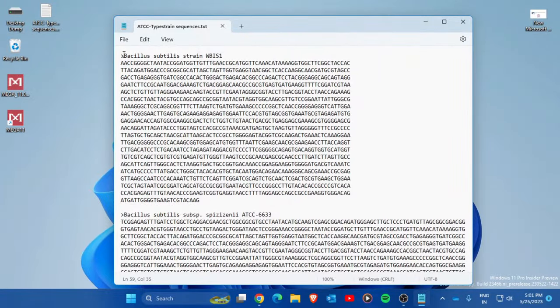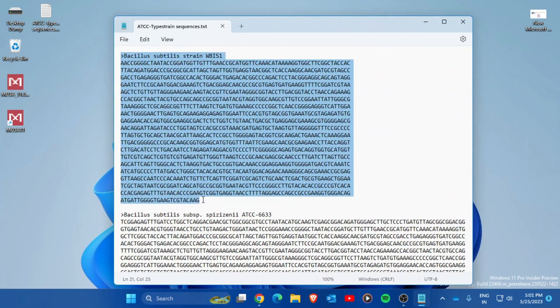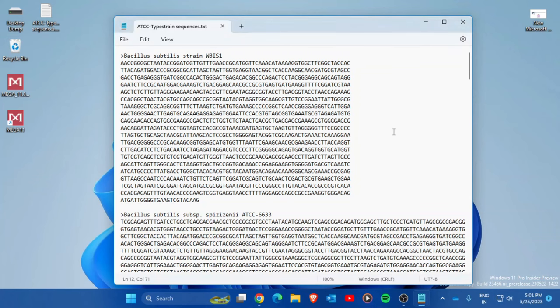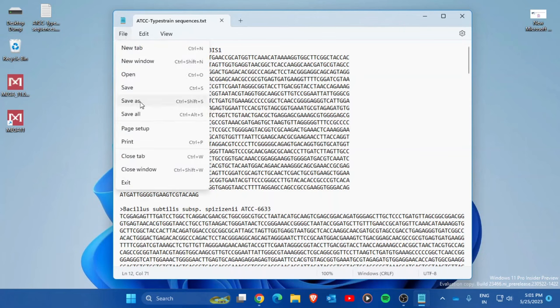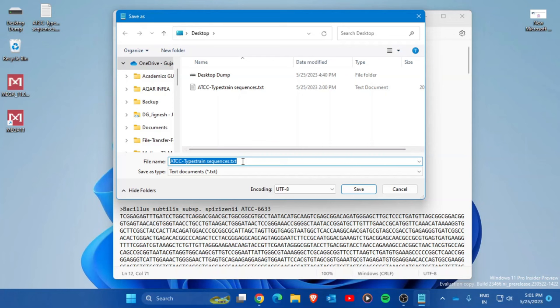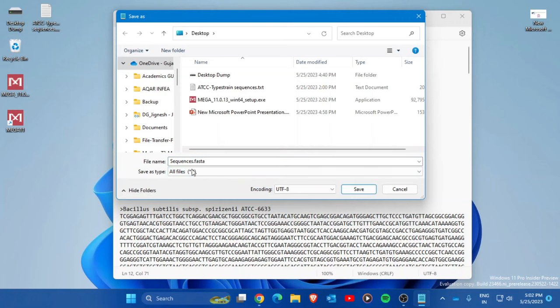The first thing you need to do is construct the notepad file consisting of FASTA sequences of 16S rRNA genes. Then you need to convert this notepad file into a FASTA file. Go to File, then Save As. Give the file a name like 'sequences', add the extension .fasta, and change the 'Save as type' to All Files. Then press Save.